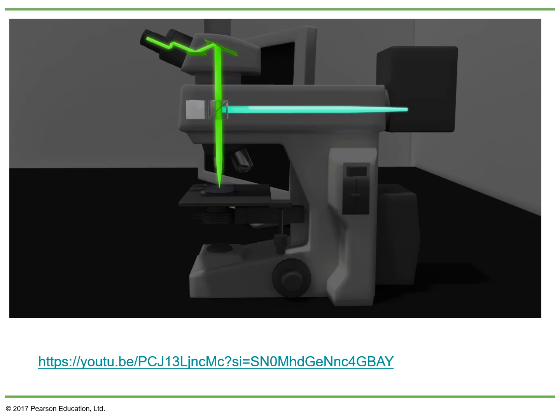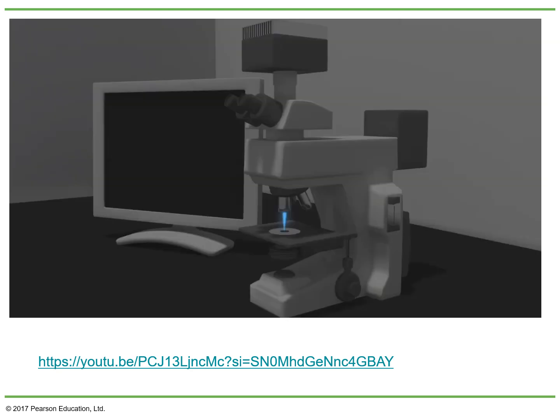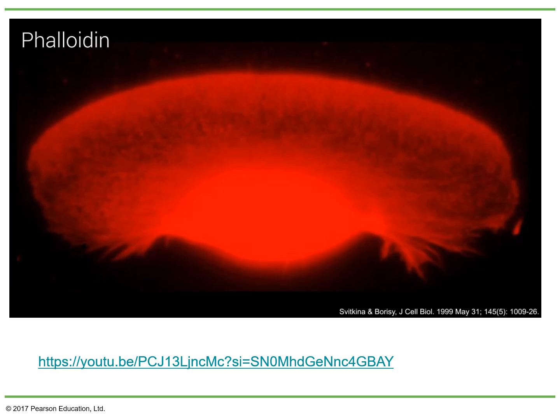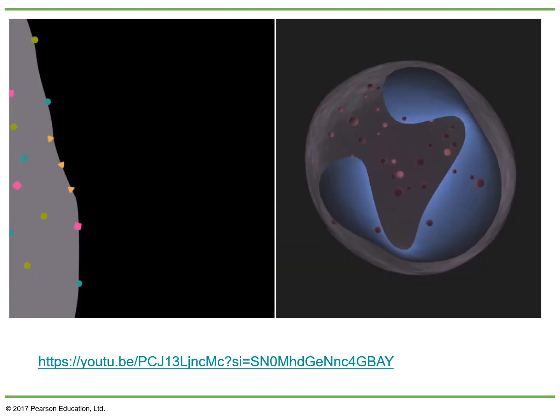One advantage to fluorescence microscopy is that it can be used to detect and visualize multiple fluorescent molecules by simply adjusting the excitation and emission filters to detect the relevant fluorophores in a sample. Fluorescent microscopy also has many useful applications in the laboratory setting. Fluorescent dyes or stains are used to detect cellular structures. One example of a commonly used fluorescent dye is DAPI, which binds to DNA, and a second example is phalloidin, which binds to F-actin. Expression, modification, and/or localization of specific proteins can also be visualized using immunofluorescence, or IF.